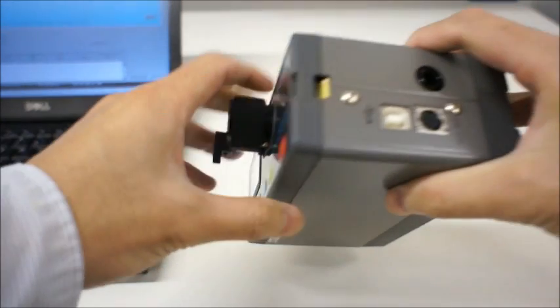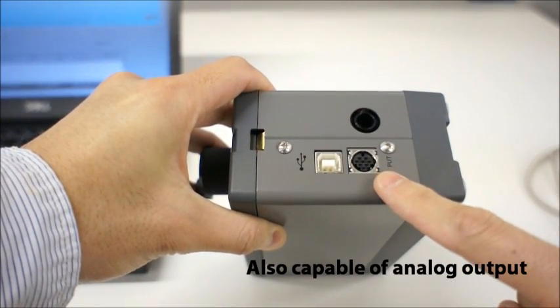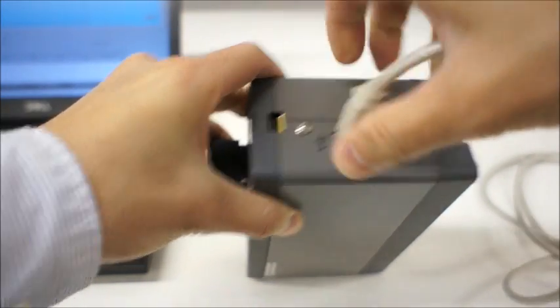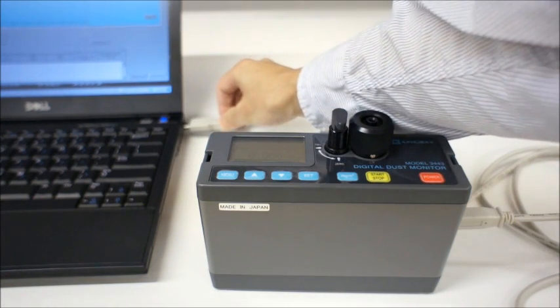The 3443 is easy to connect to a PC with the included PC cable and software. Analog output is also standard, allowing the instrument to be connected to an alarm or controller.